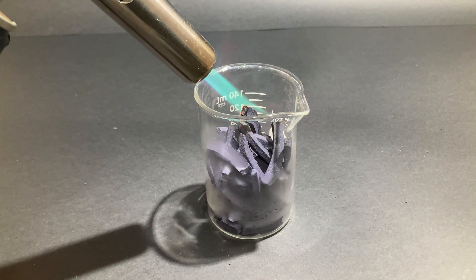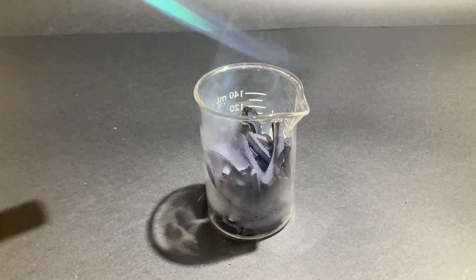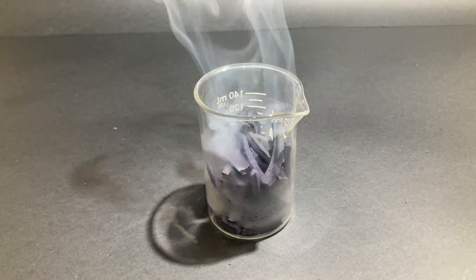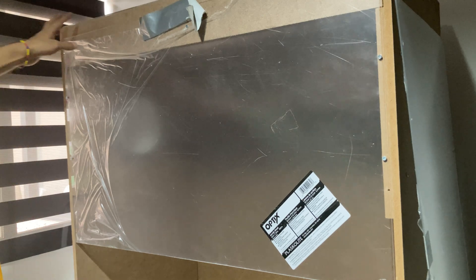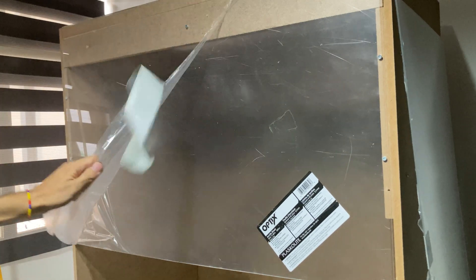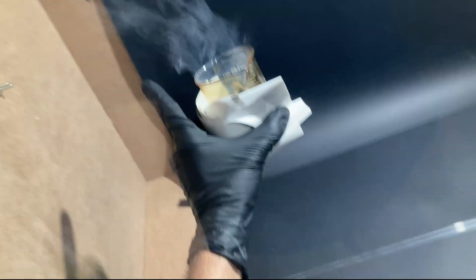One of the biggest risks that people often overlook is the production of harmful fumes during experiments. Breathing in these fumes can be seriously bad for your health. In this video, I will show you a homemade fume hood that I built to do chemistry at home in a safer way.